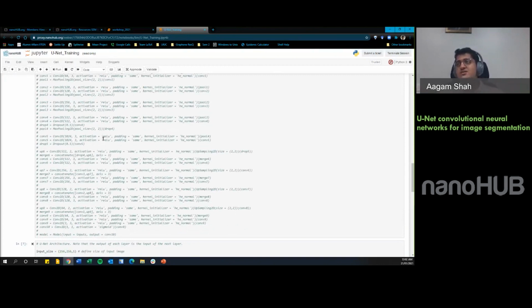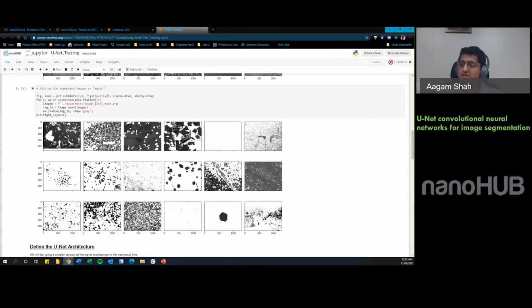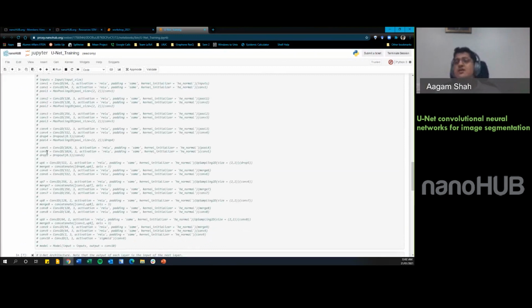What I'd like to point out is in this space, an image of graphene is now essentially divided into multiple parts, where each domain of graphene, or each grain of graphene, if you take this image here, each one of these domains is now represented as an independent image. So what is initially 16 images is going to be a lot many more images in the latent space, after we perform so many convolution functions on it.